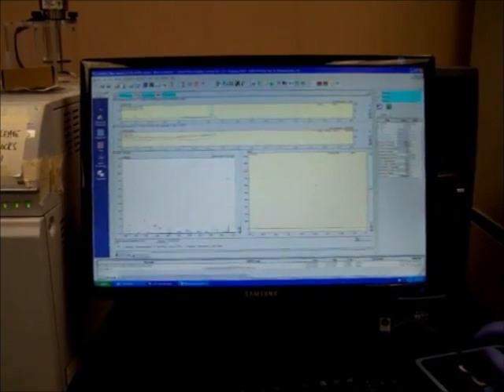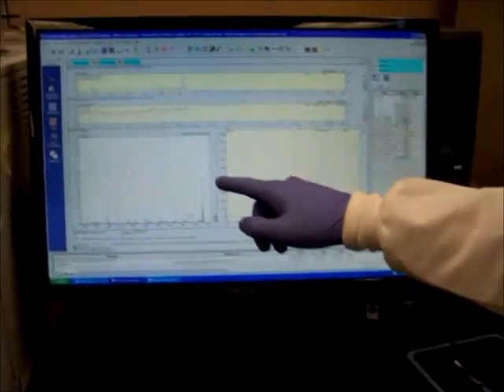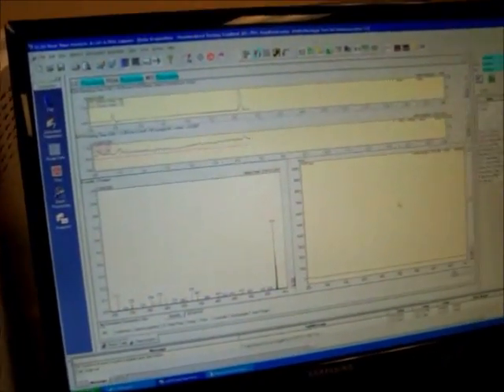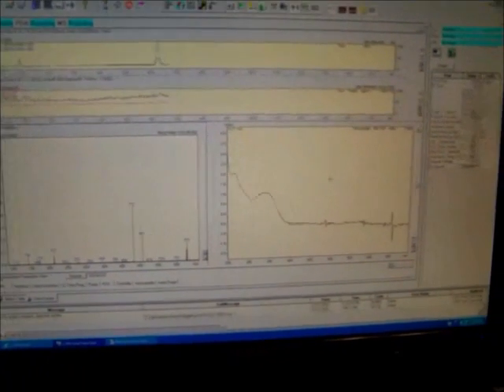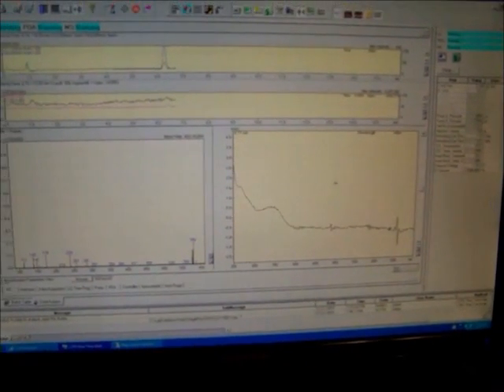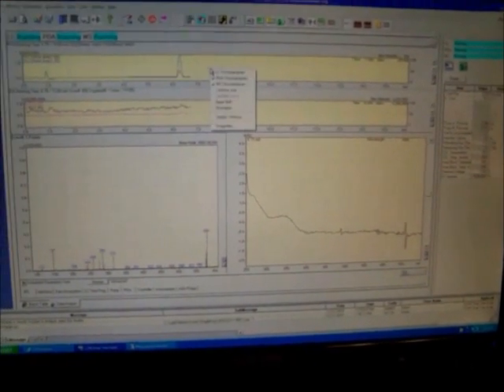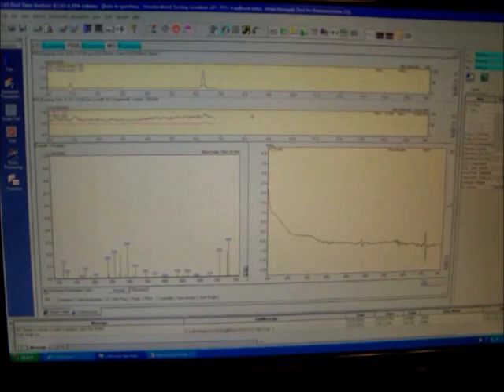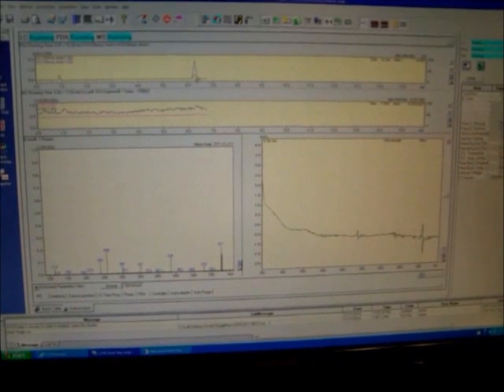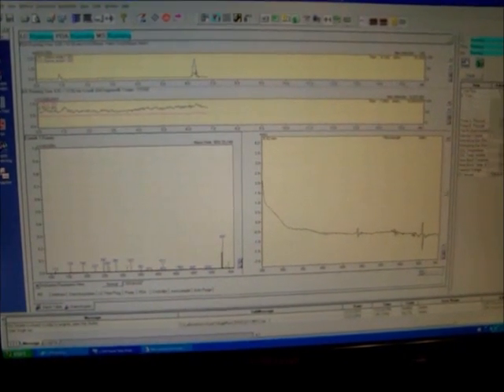OK, so now we've got our ion ascending there. This is the Naringin coming out. We know that from past experiences. The Naringin will elute at about 6 minutes 30 seconds.